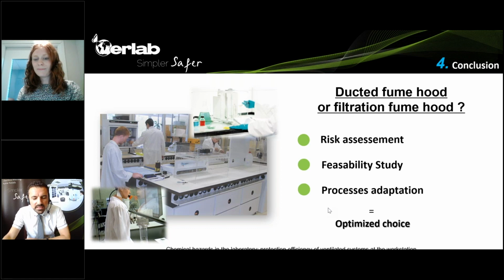So that's right. And this is also what Alice just mentioned, Kate. This could be a problem when there is maintenance. The fact that toxic powders could be stuck in the exhaust system, in the fan, could really be a concern for the safety of the people who are actually going to do the maintenance.